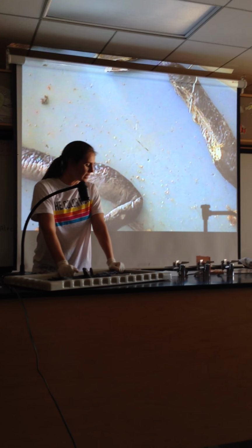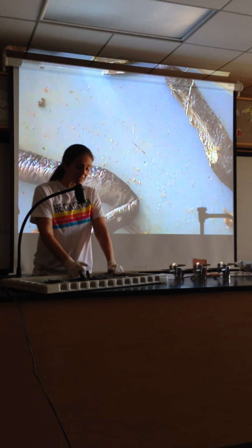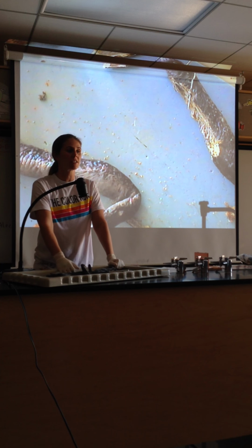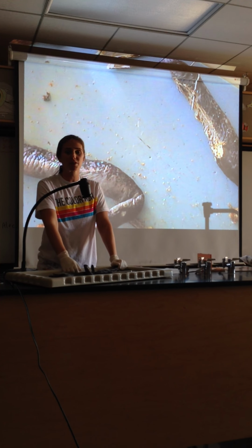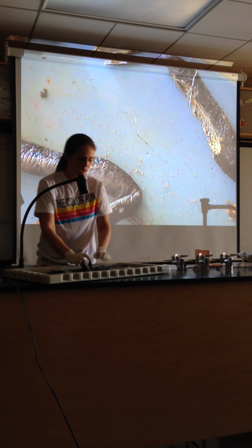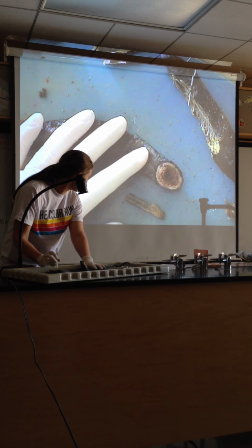The lamprey dissection, Petromyzoniformes. I'm going to go through all the different things that you need to see. Some of them are going to be a little bit harder for you to see, some will be a little bit easier. Of course, this particular organism was dissected a few hours ago, so it's going to look a little stale, but we're going to do the best we can. All right, looking at the external structures first. Are we okay with that?